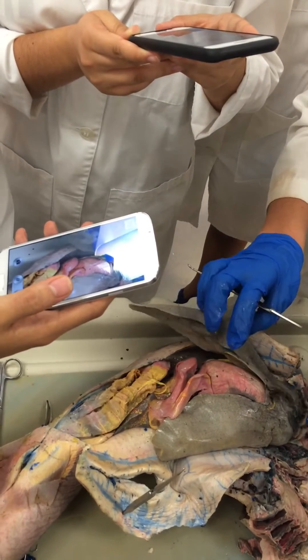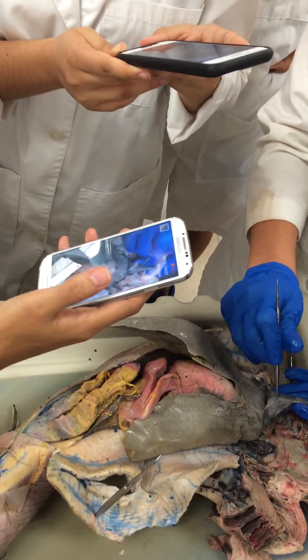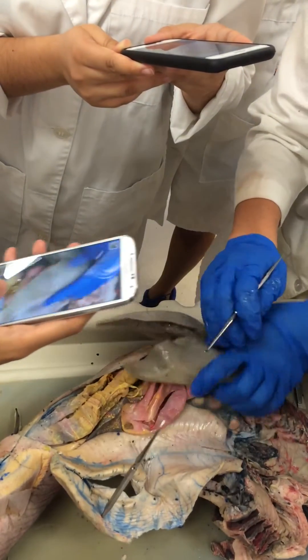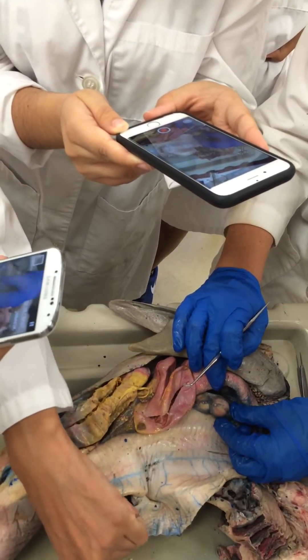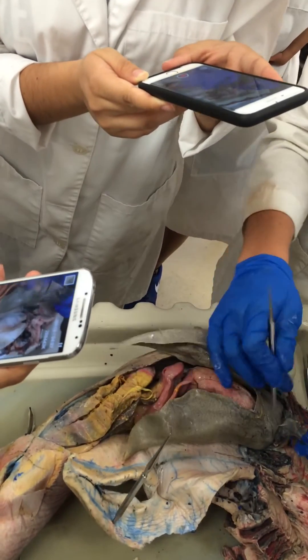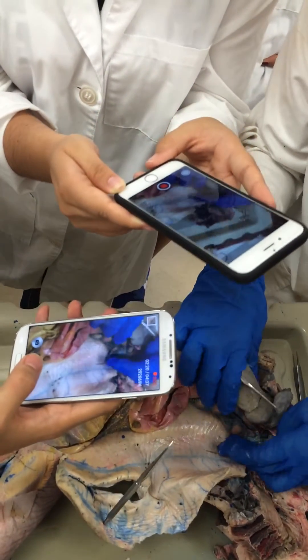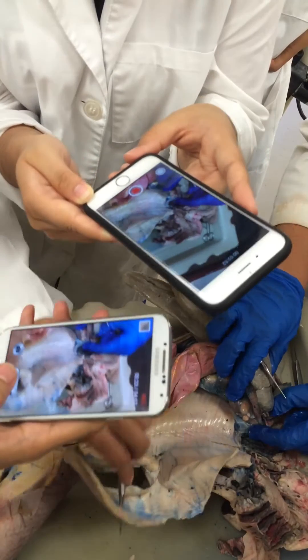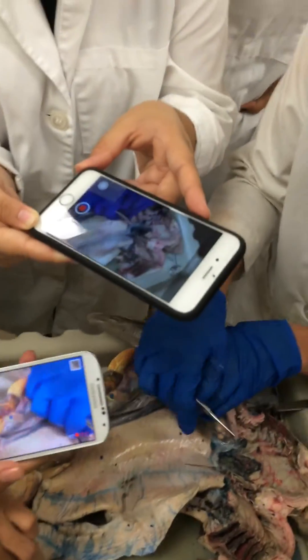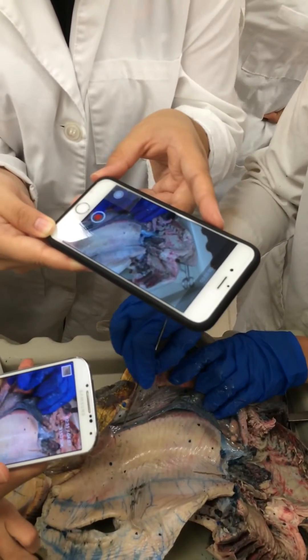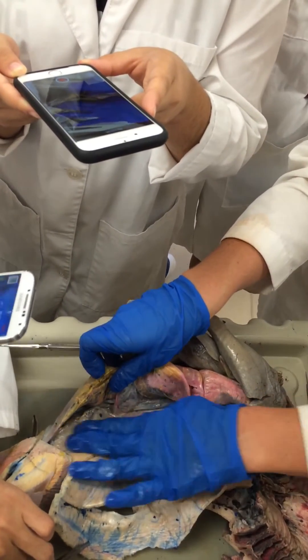The falciform ligament has a large opening called the ostium tube, and that's where the eggs go in. The ovaries — you've got a left ovary here full of eggs. The egg would rupture out of the ovary, float through the body cavity, and into the ostium tube. It would follow the oviduct around. We actually cut through the oviduct, and it would run behind the ovary, through the oviduct, and then the shark fetuses would mature in the uterine horn.